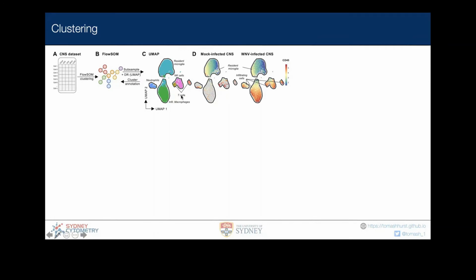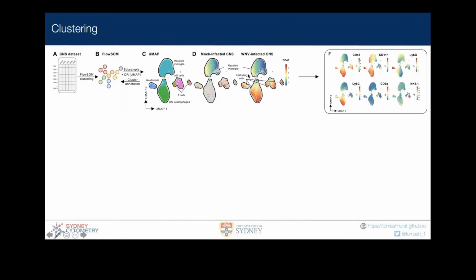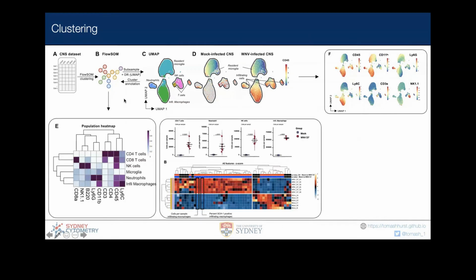And so even if we have small numbers of cells, like in this case, this T cell island in red is quite a low number of cells. Maybe it's, let's say, 50 cells. We want to have large numbers for robust statistics. What we can do here is essentially say, if we know cluster 4 is our CD4 T cells, and there's only 50 of them on the plot, cluster 4 in the large data set is going to be the same population, but in this case, we might have thousands to millions of cells, and we can get more robust statistics out of the data that way. So we can use this subsample data for plotting, figure out what all our populations are. Once we've got that, we can then go and do our quantitative work with reasonable statistical power.